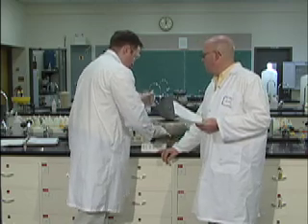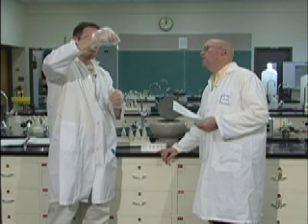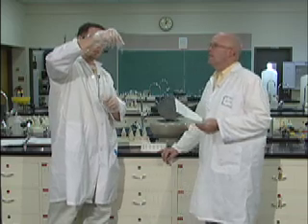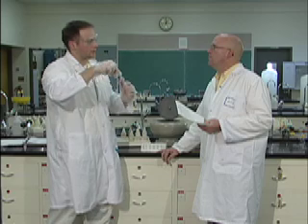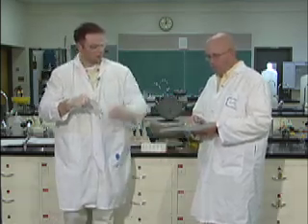All right. So now we've got our solid in here again. It doesn't look like much solid. No, there's solid, but you can see the jelly on the sides there. So we do have some solid left in there. What we're going to do with our solid here is figure out whether it's aluminum solid or iron solid. Let me see our chart on here.